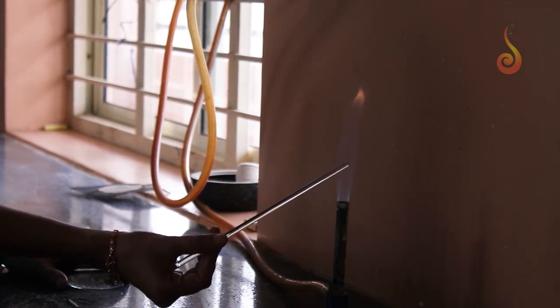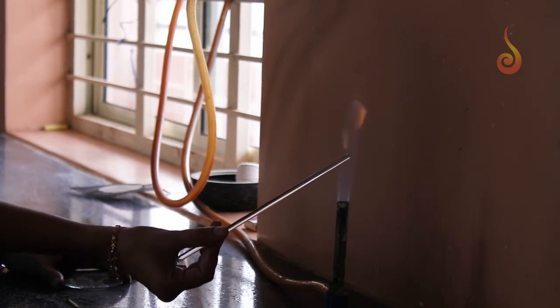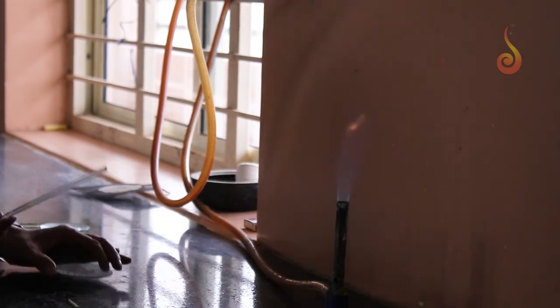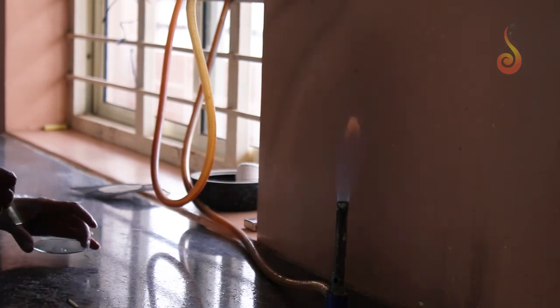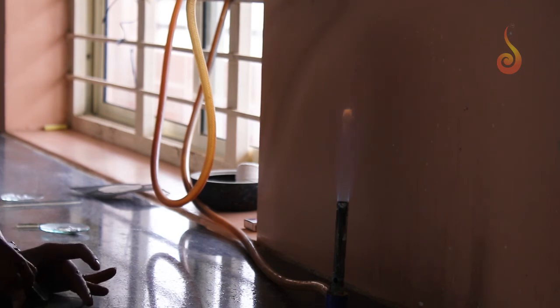So we are observing an apple green color in the flame, which means it's indicating barium ion. So we have observed how the apple green color is obtained. Now we'll look into the strontium radical.